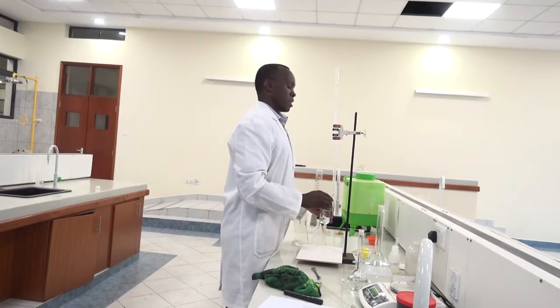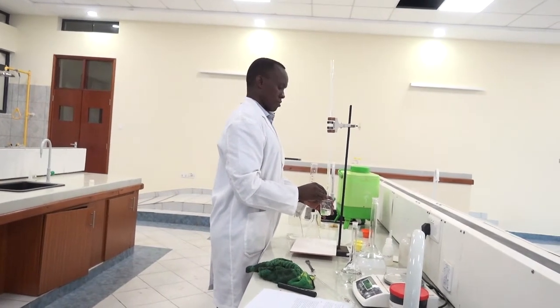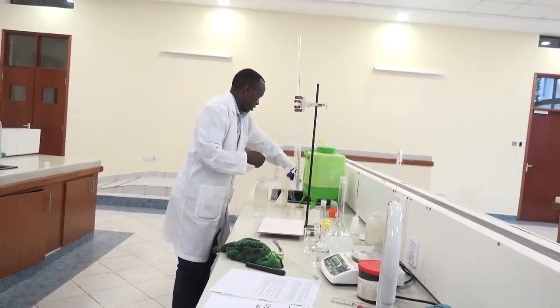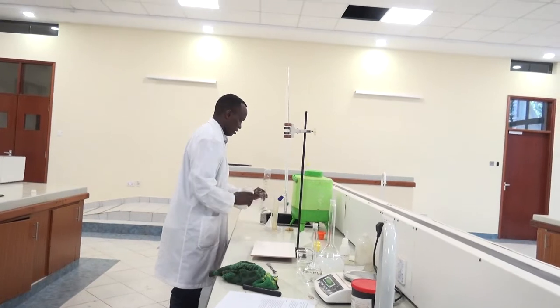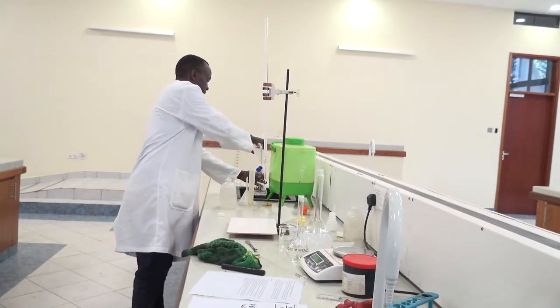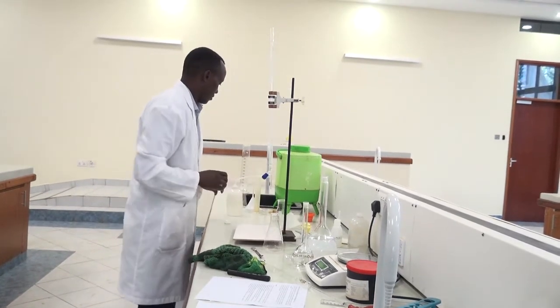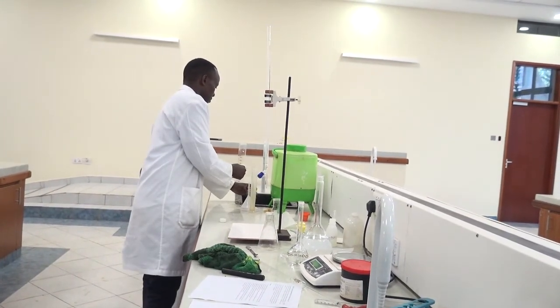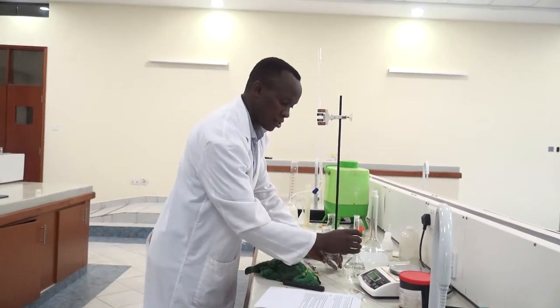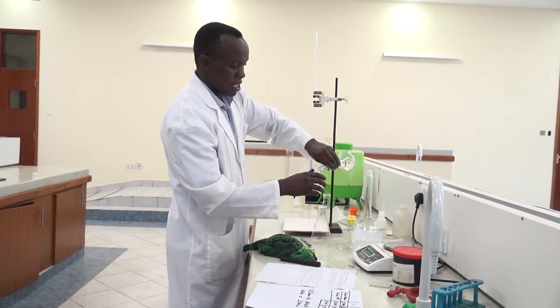and get the mark back to zero. After that, I wash my conical flask. Now I want to do the last titration. I now pipette my sodium hydroxide.